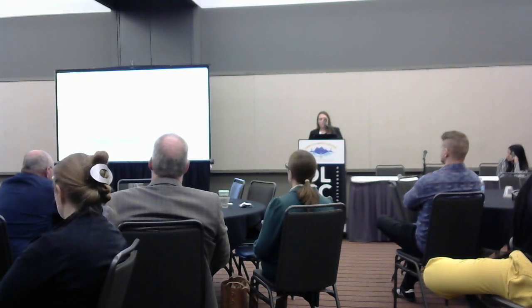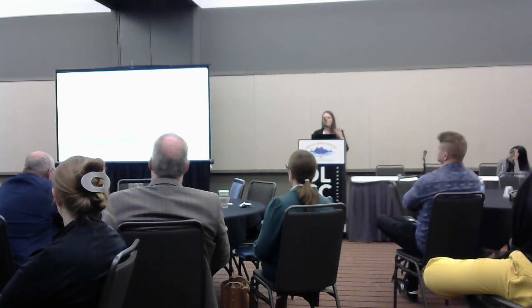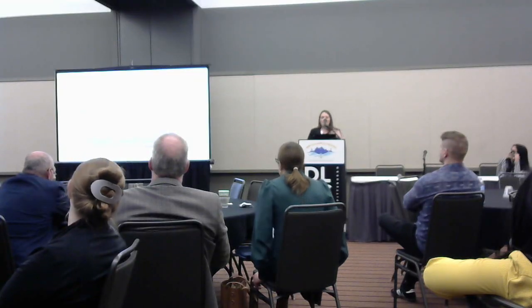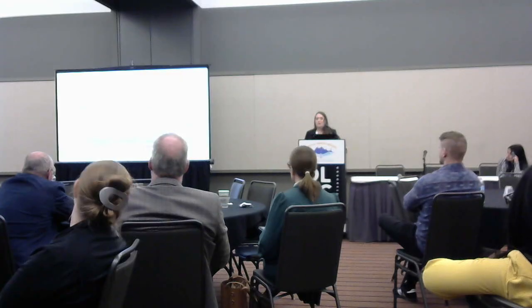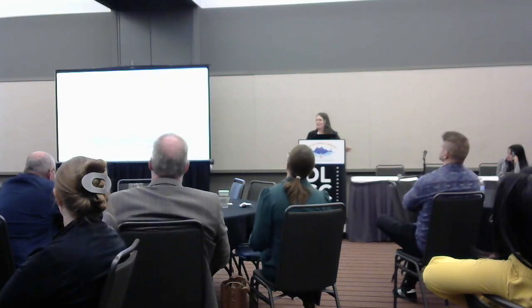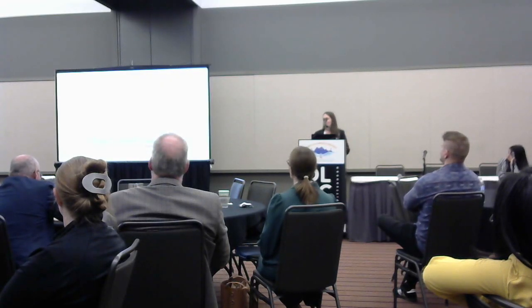In the other course, we covered similar topics. What's an image, intensity values, thresholding, different pre and post processing steps, and then a ton of other options. So we covered lots of things hoping to hit everybody. But with these diverse topics came lots of diverse data sets as well. So at this point, I hope that you're thinking there's lots of benefit in each of these, maybe some drawbacks in each of these as well. For example, exposure to different data in one, good knowledge of the data in the other.